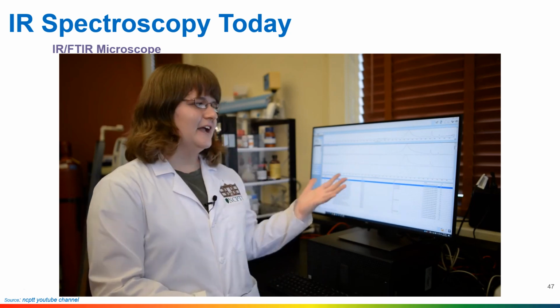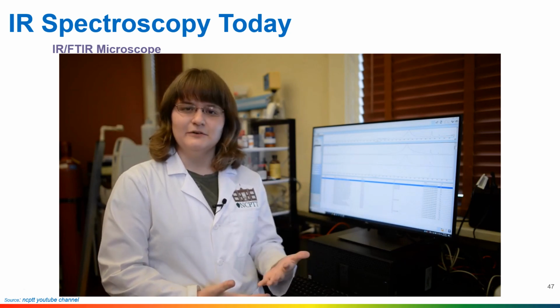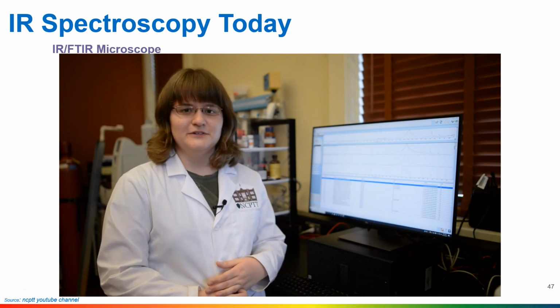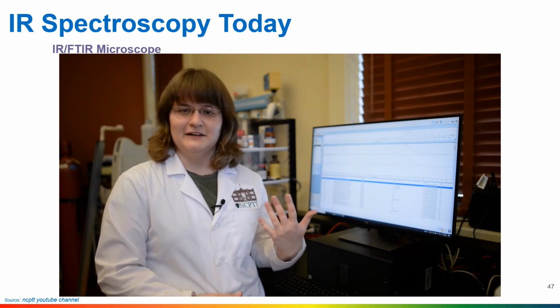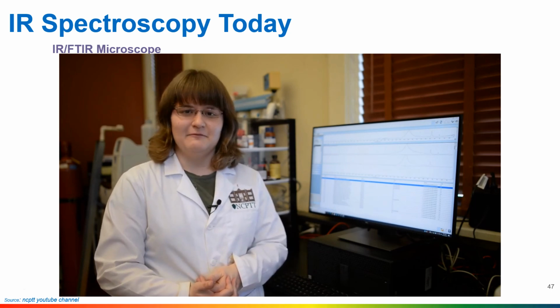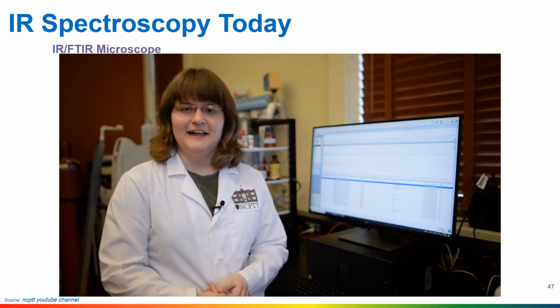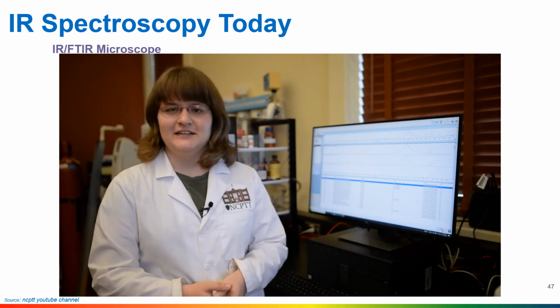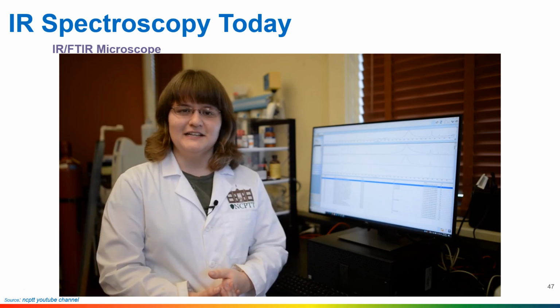So you can see this is very helpful in helping us identify what groups are in the materials and the chemicals and the substrates that we're using, so that we're able to identify whether, again, like I said, there's contaminants, or maybe like for my project, herbicide residues left behind. Or if we have an unknown material, we can also try to identify it this way. So that's pretty much it. You can see this is a pretty useful instrument in the lab.